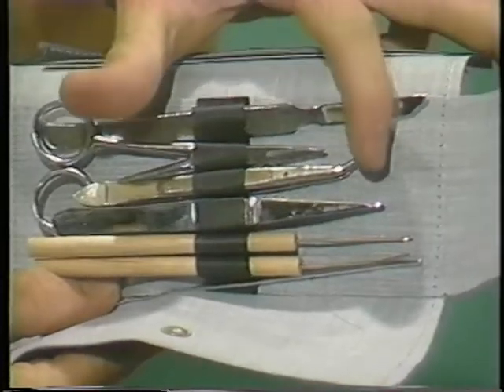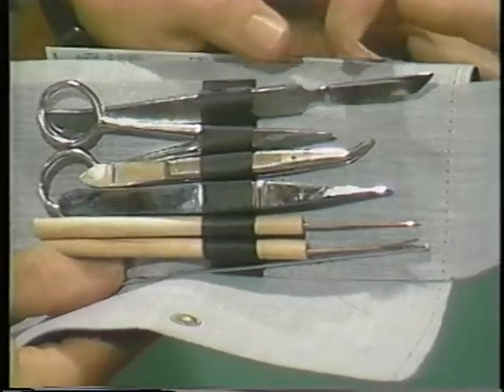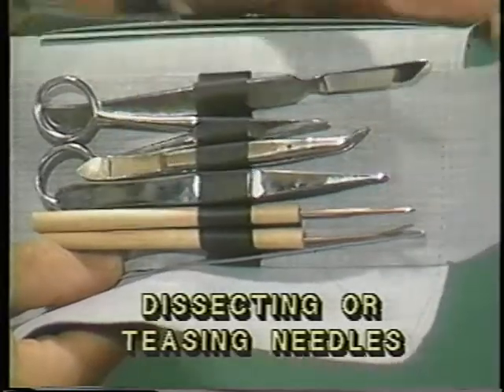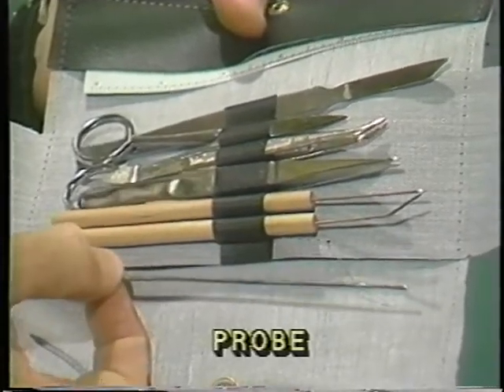Then there's two pair of forceps, a straight one and a bent one. These are not called tweezers, but forceps. Then we have two different types of teasing needles. There's one with a straight tip and one with a bent tip. And then this final item down here is called a probe. It's blunt on the end and it's used for probing around things.